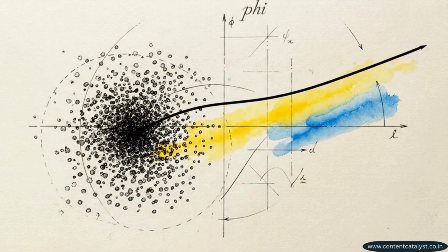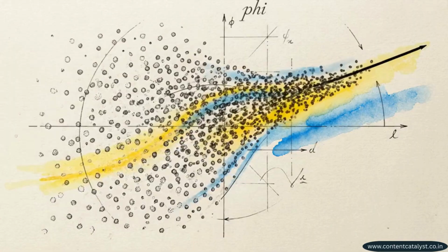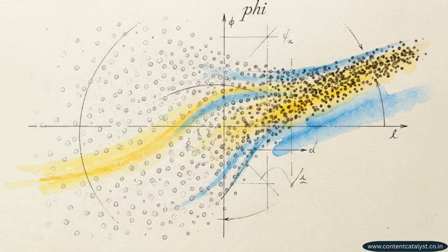By locking variables into a continuous trend, labs capture the true physical evolution of a sample, actively preventing the overfitting of isolated noisy data points.